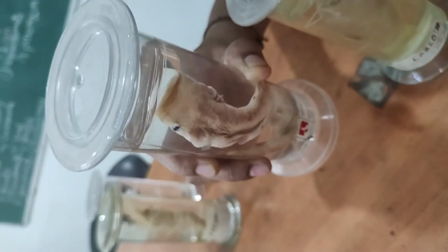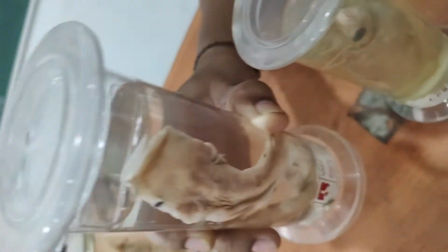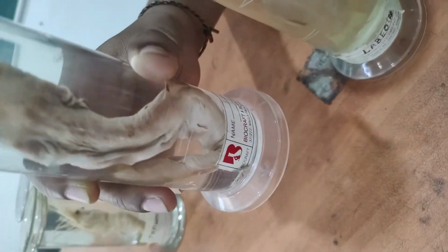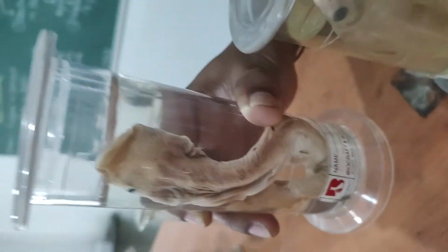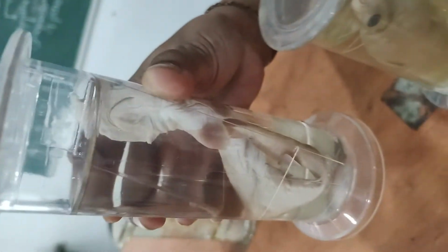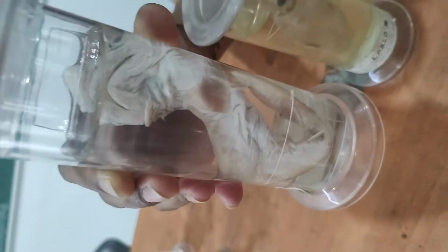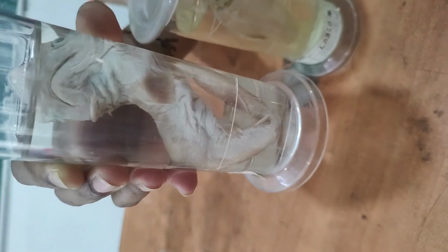The position of the mouth is ventral. They have two dorsal fins. The tail fin is formed of two unequal lobes, you can see their tail fin. So this tail fin is heterocercal, that means unequal lobes, or asymmetrical.